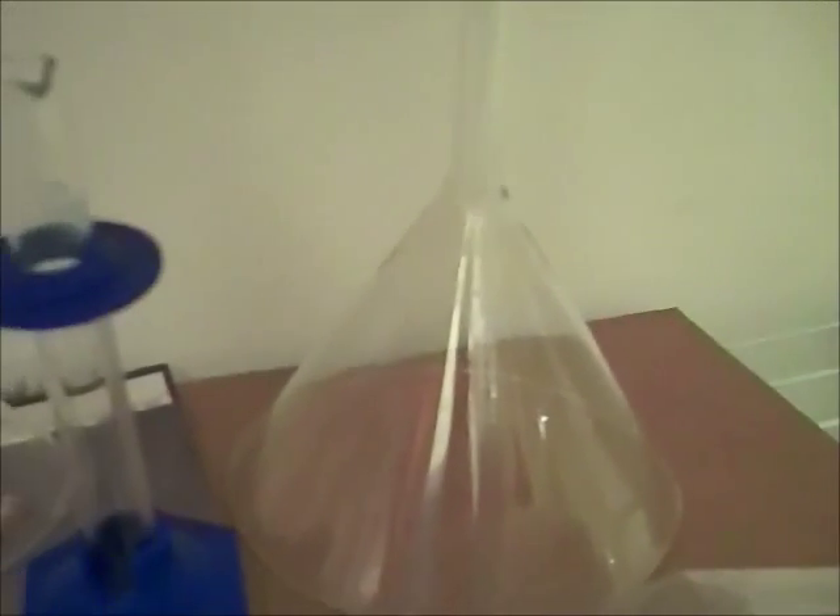This is a pretty interesting thing I got — it is a polypropylene-based beaker. It is rumored that these are on par with glass beakers when it comes to chemical resistance, but they can't be heated. The advantage is that they're less delicate than glass and less expensive, so they're worth checking out. Here's a graduated cylinder of 10 milliliters; my 100 milliliter size is also somewhere else. Small funnel, large funnel — I use these when I need something that won't contaminate my filtrate. And here's some vials that I plan on using to store stuff in later, and some eyedroppers — one of them is messed up with manganese dioxide, I'm working on that.